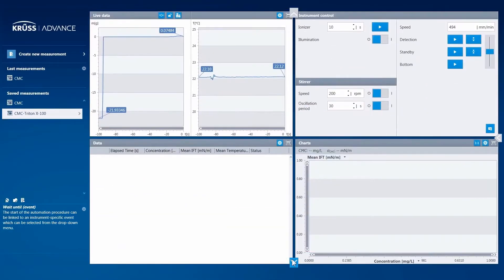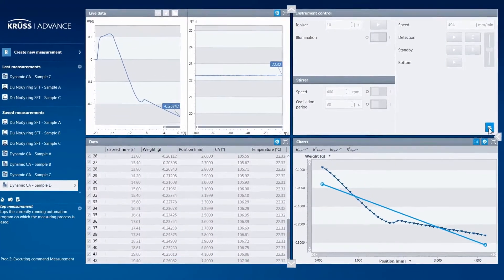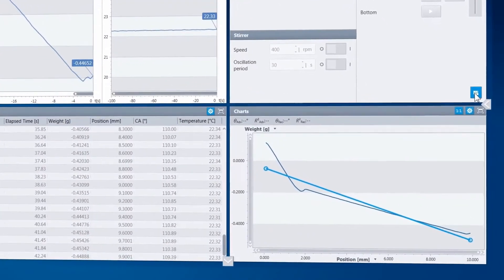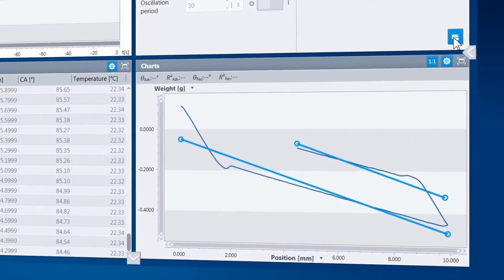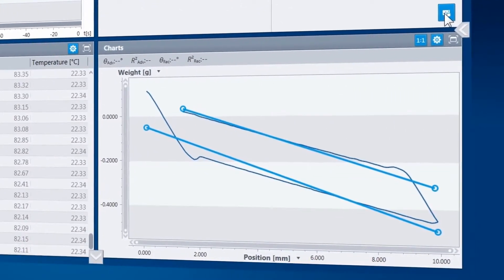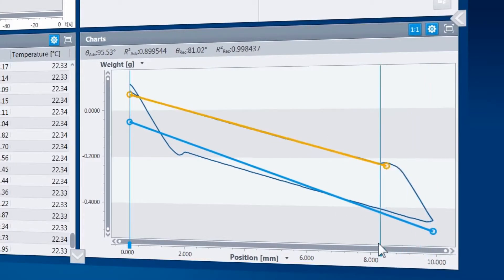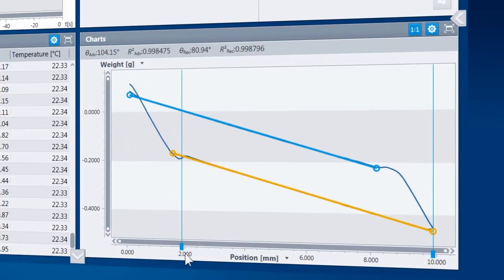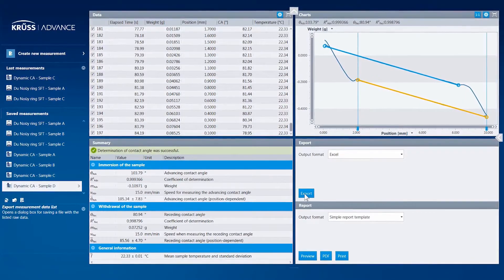Measuring the advancing and receding contact angles gives you the most accurate look at the wetting and de-wetting behavior of your material, defining, for example, liquid repellency. And even after making the measurements, Advance helps you analyze and organize the results with powerful graphical features and automatic data exports.